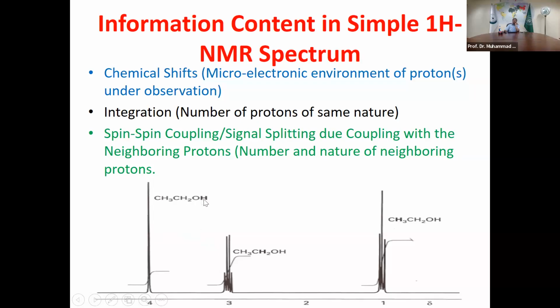CH2 is one atom away, because the carbon is directly connected to oxygen, but the protons are one carbon away. As a result, they appear a bit more shielded, and CH3, which is still far away from oxygen, will appear more shielded.